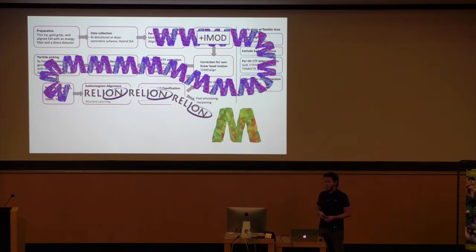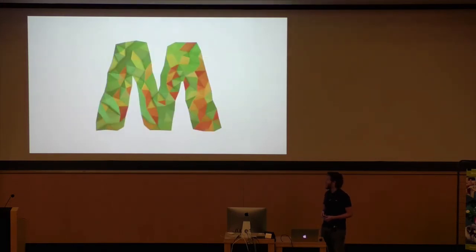If you've been following me on Twitter, then you probably already heard all about M. But just a few words. M is basically the opposite of Warp. It lives on the other end of the pipeline. You know, it's like in Nintendo games, Mario and Wario, except calling it MARP probably would not have attracted that many users.